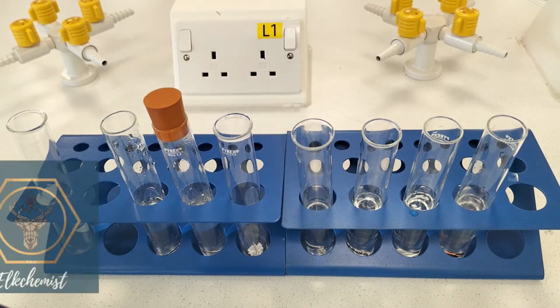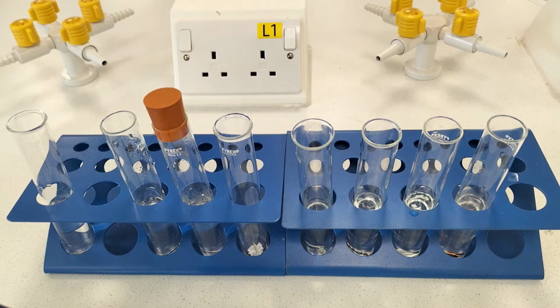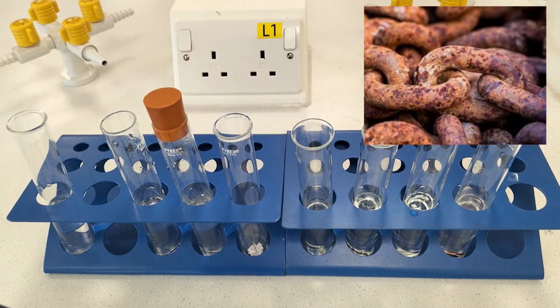Hi there, welcome to this Elkchemist chemistry practical video looking at rusting and the factors that affect the speed of rusting. So rusting is a form of corrosion unique to iron, and effectively what rust actually is is a compound known as hydrated iron(III) oxide. And it's not great for the iron because it is weak, brittle, flaky, and it compromises the structural integrity of the iron metal itself. So we want to try and avoid rusting as much as possible.